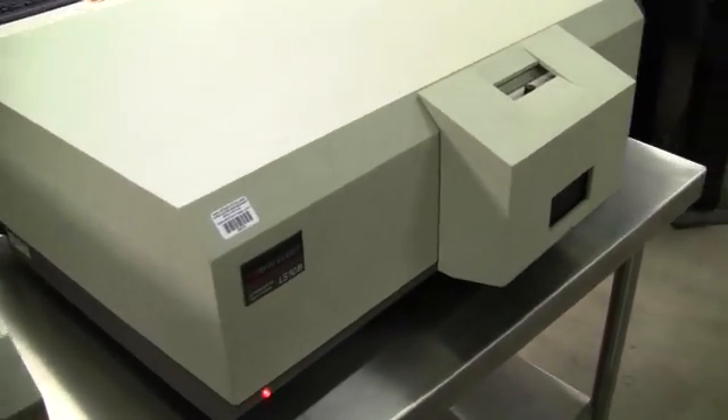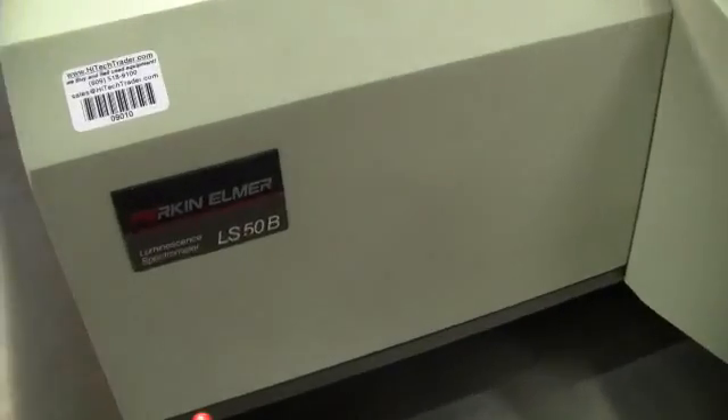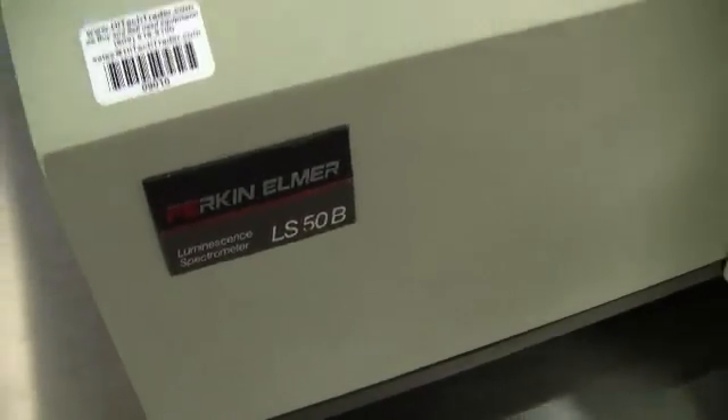Hi, this is Michael Natow from Hi-Tech Trader. Today we're looking at a Perkin-Elmer Luminescence Spectrophotometer. The model is LS50B.